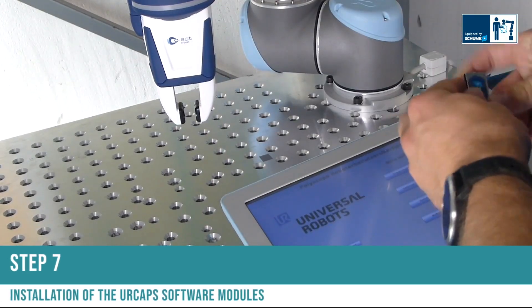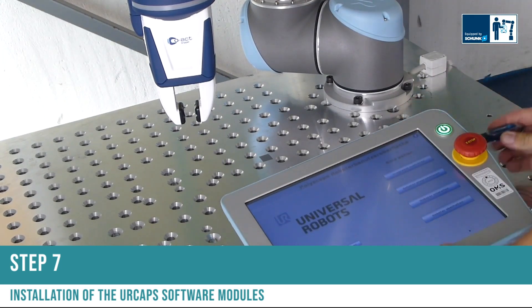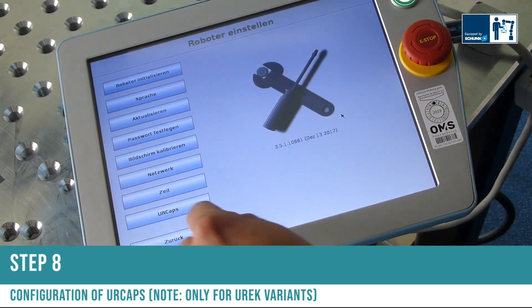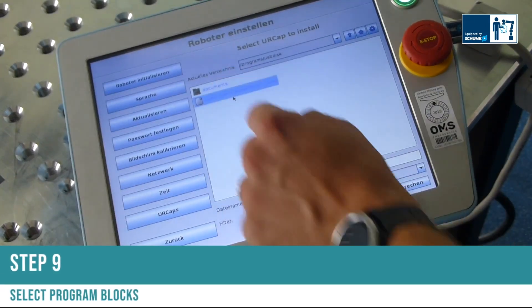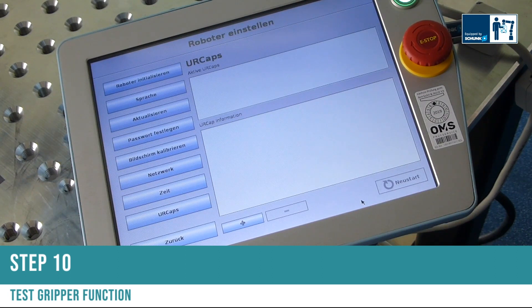Step seven: installation of the URCAPS software modules. Step eight: configuration of the URCAPS modules. Note: this is only for the UREK variants. Step nine: select the program blocks. Step ten: test the gripper function.